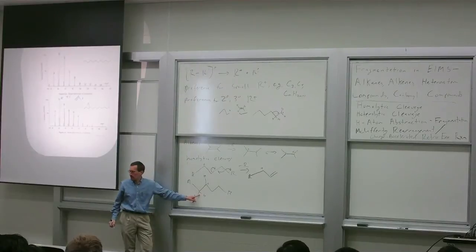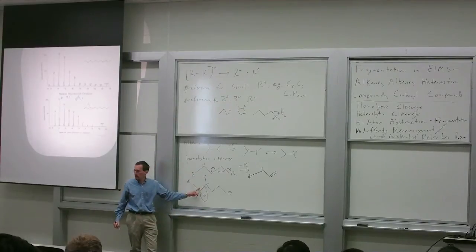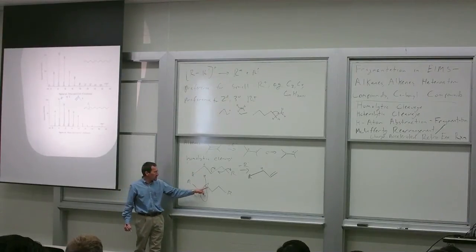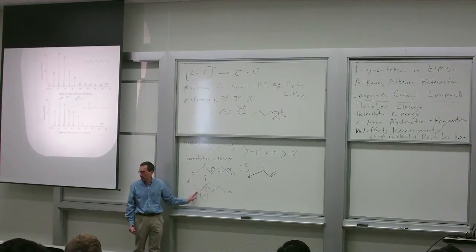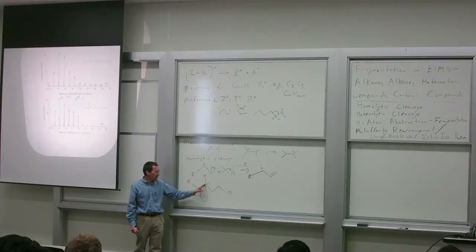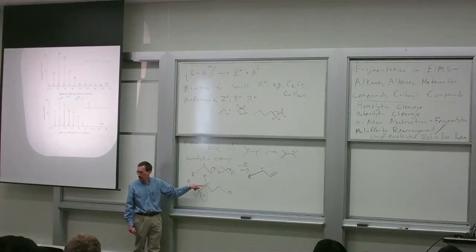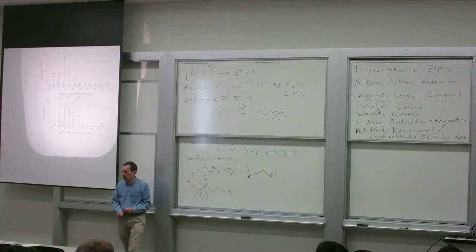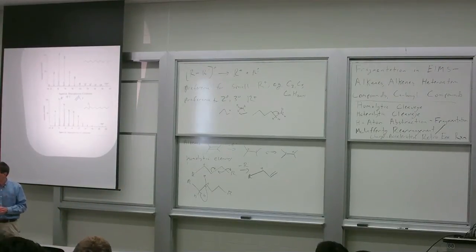So the first step in the process of rearrangement is a 1-2 hydride shift, which puts your positive charge over here. Now realize that by resonance you can have your positive charge here or also here. Remember, that's back to your freshman chemistry. Just pick up the electron, move it to the other position. Then you can end up with another 1-2 hydride shift, and that moves your alkene, the radical cation, over here. So you can walk it all over the molecule, and it does indeed walk. So that means that you're not able to see where the alkene is in the molecule. All right, I think that's what I want to say about alkanes and alkenes.